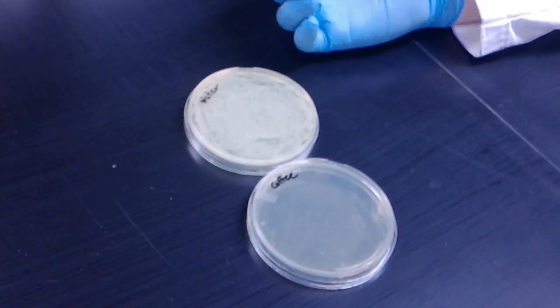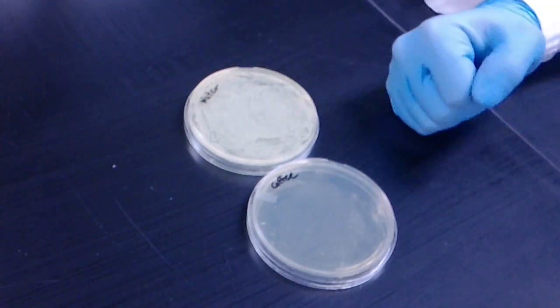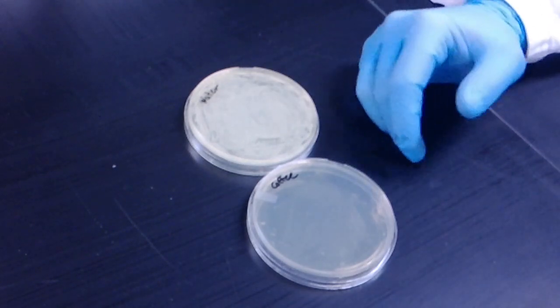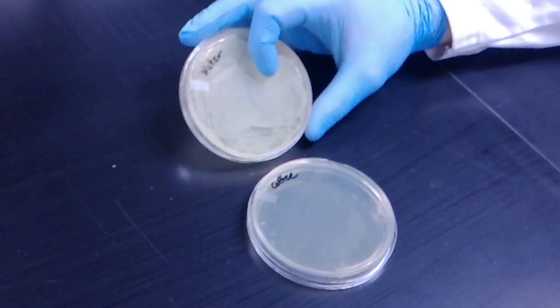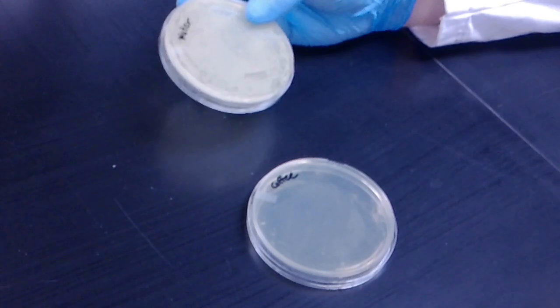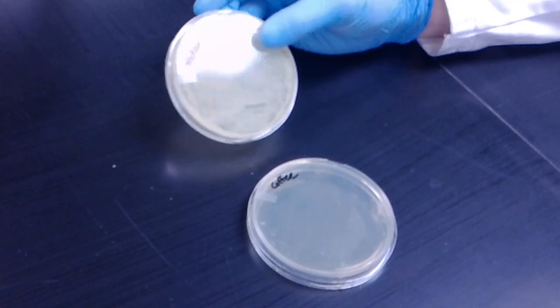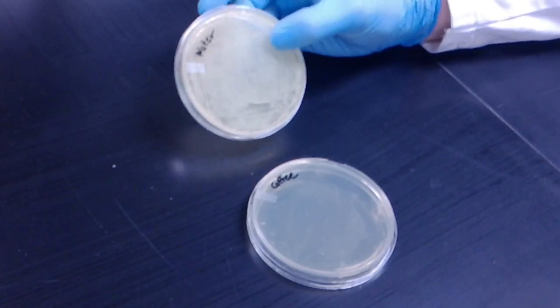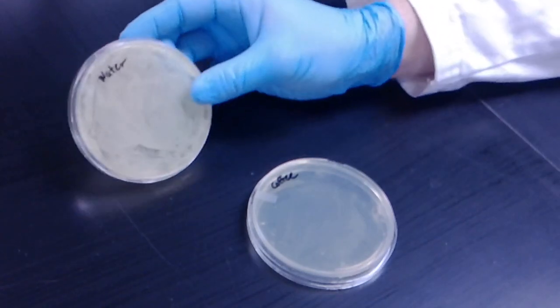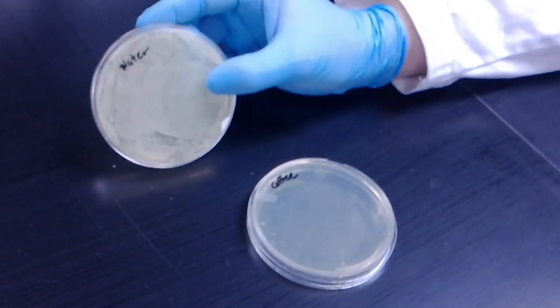Okay, so recently there's a study published that not washing your water bottle could be a great source of salmonella and other microbial disease or infection. So seeing this, after noticing that I myself had left my water bottle sitting with water in it for a few weeks, I thought it'd be an interesting little experiment to look at. So what we did here is we plated 100 microliters of both the coffee and the water. So you can see here we have a lot of bacterial growth on our water.